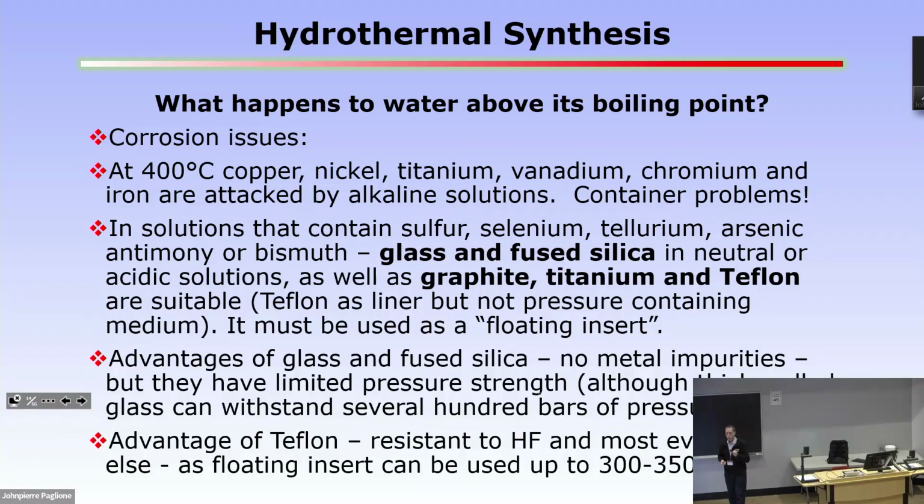Now it doesn't have to hold the pressure in because you have liquid on the outside, inside the autoclave, that counterbalances it. So it's strictly to contain your reaction and to preserve your autoclave, because you don't want that to corrode. Many of them can break pretty quickly if you happen to do that.